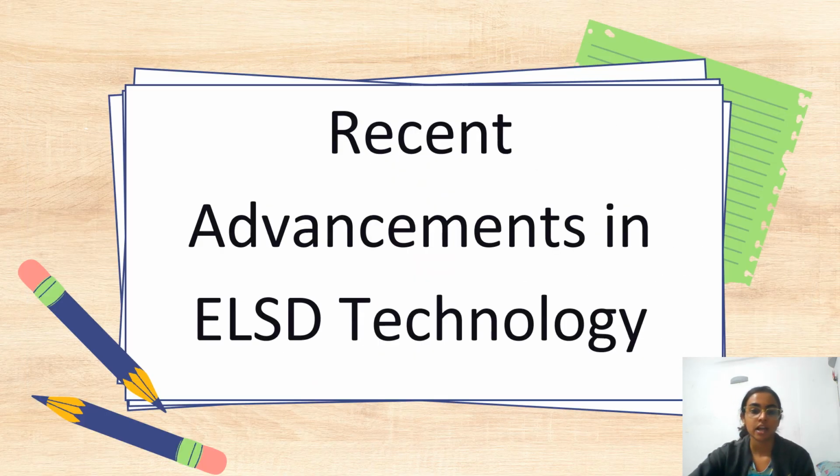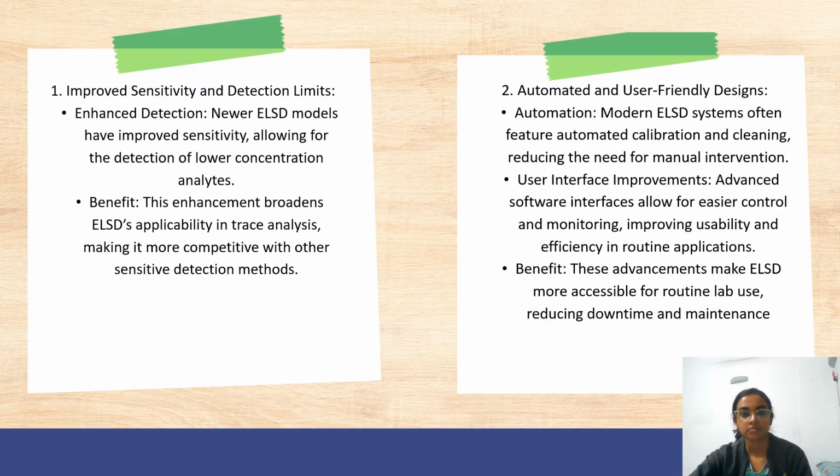Let's see the recent advancements in ELSD technology. First one is improved sensitivity and detection limits. Enhanced detection: newer ELSD models have improved sensitivity, allowing for detection of lower concentrations. This is beneficial for broadening ELSD applicability in trace analysis, making it more competitive with other sensitive detection methods.